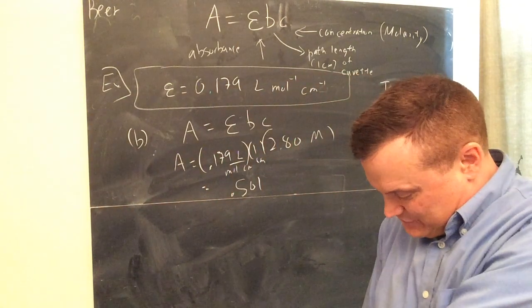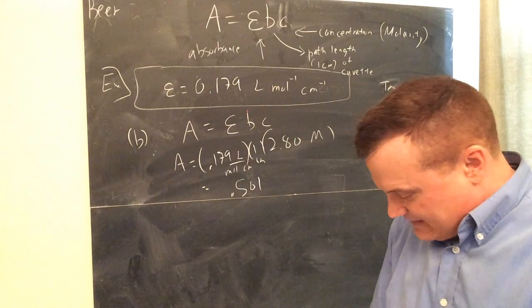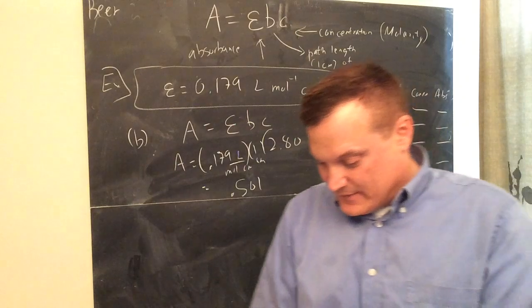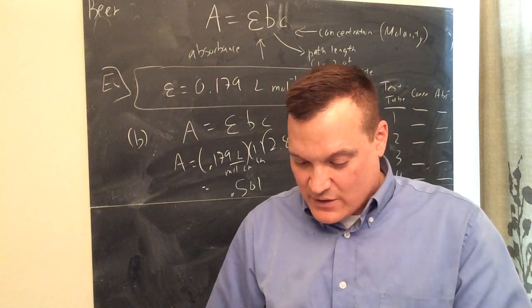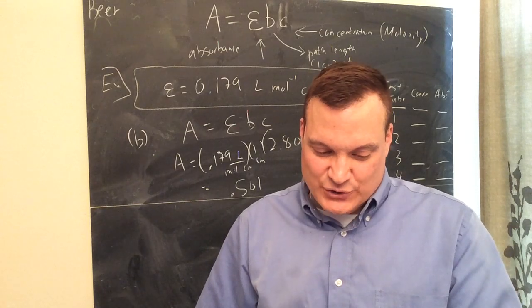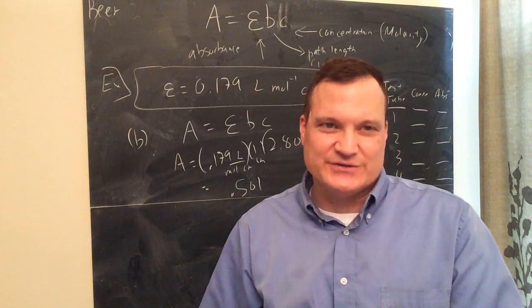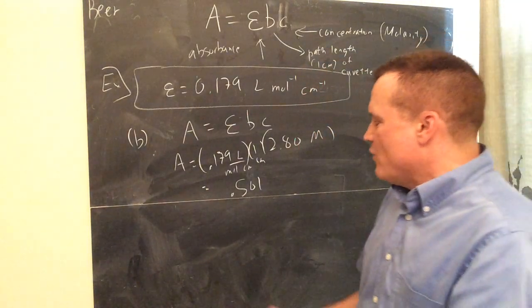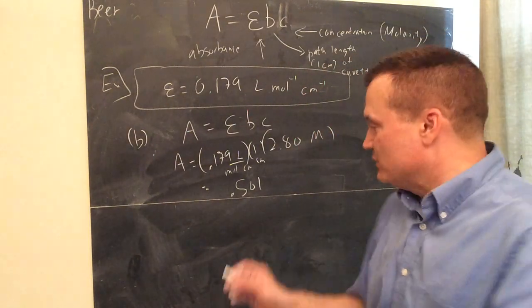So now, as far as the lab, what do I want you to do? Okay, so I've done that first little bit. On the pre-lab, on the next question, letter A, number 1, I want you to tell me what is Beer's law. Answer that one. Number 2, you don't really have to worry about serial dilution because when we do the lab, I don't have a serial dilution. But I'll tell you what it is though, just in case you want to know.